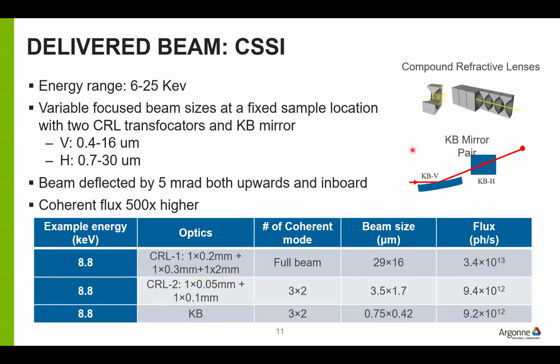Okay, what kind of performance do we get from this? So again, we're tunable over this range. And depending on what focusing elements we use, we have a spot size from about 30 microns down to sub-micron for the CSSI technique.